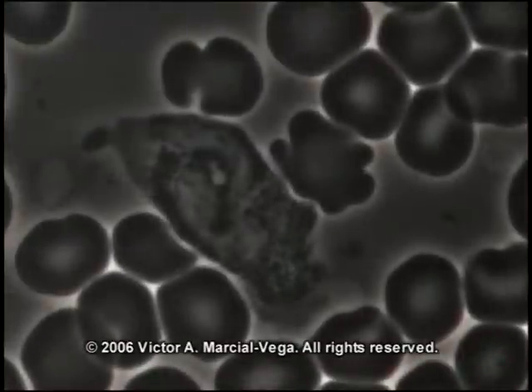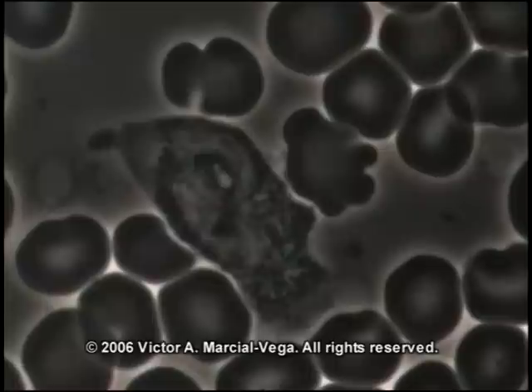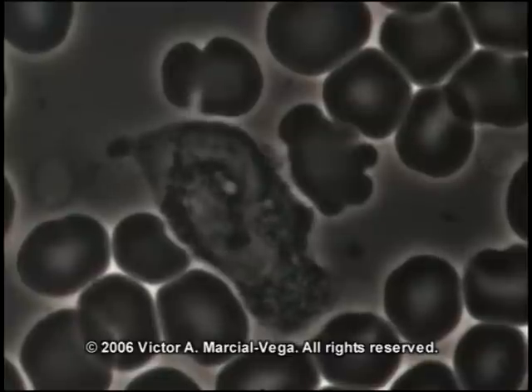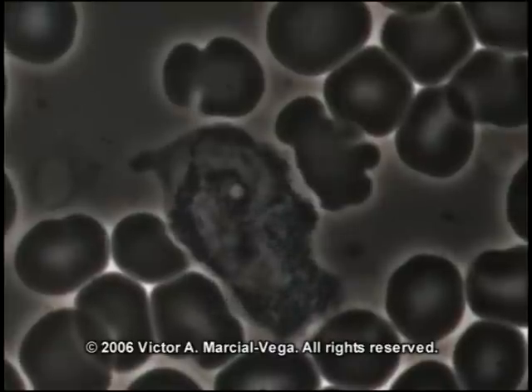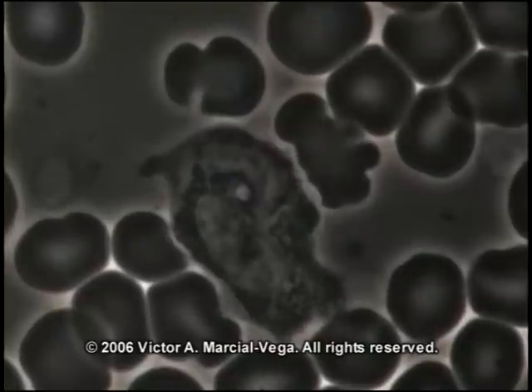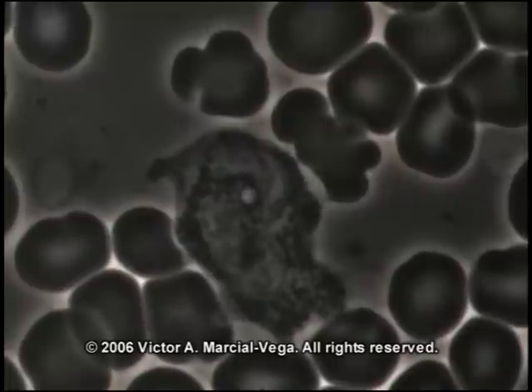So he's already got a hold of it, and little by little is gonna engulf it and eat it, because that's what this cell does. It already has recognized this fungus as something that's not supposed to be there. This doesn't happen automatically. But little by little, as you can see, it's surrounding it and it doesn't let it go. This is almost completely inside of this cell already. And this is what we want to see in your system. Okay.